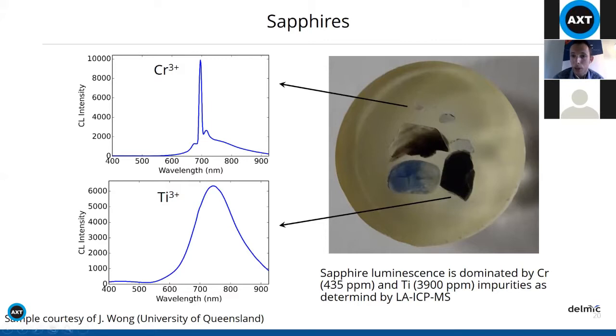In some other sapphires, the concentration was about 2 ppm, and you can still very clearly see it in the cathodoluminescence spectrum. So in that case, you can detect ionic species well below the detection threshold for EDS, for example, or even WDS. In some particular cases, you can be very sensitive and measure very low concentrations.